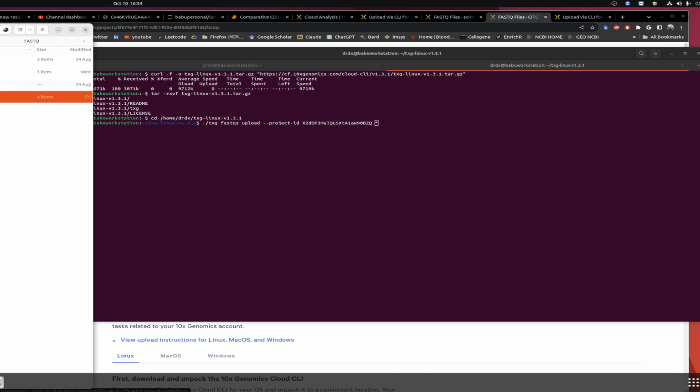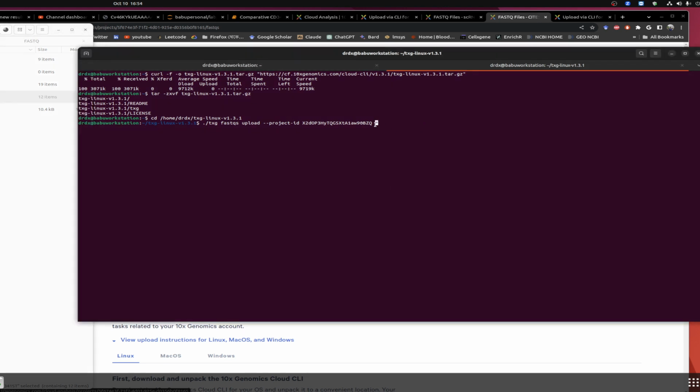Let's assume our files are in this specific folder. So copy our folder in here and then click.